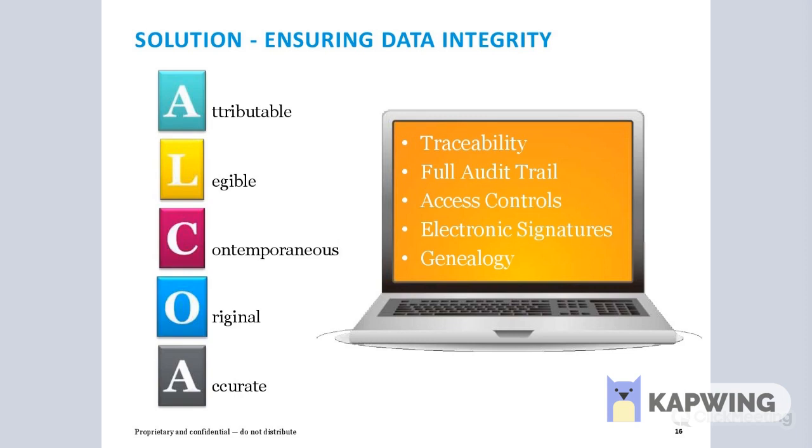Contemporaneous means that the result was recorded at the exact time of capture. Using a LIMS is the only way to guarantee this requirement. All testing that is performed in LIMS will have a date timestamp attached to the record by turning on the audit trail. So as the result is entered, the auditors will be able to see exact times that this happened.